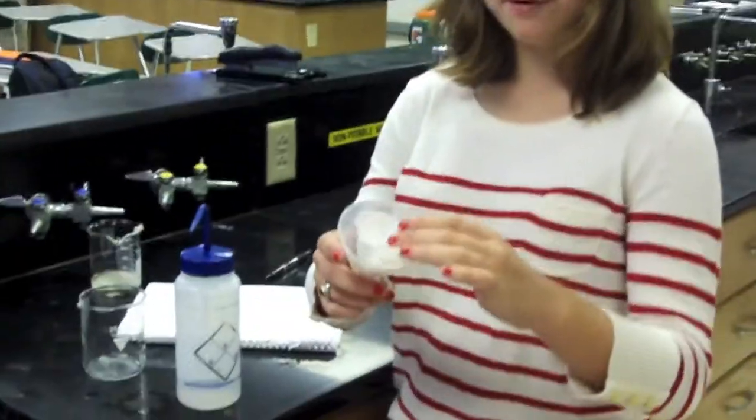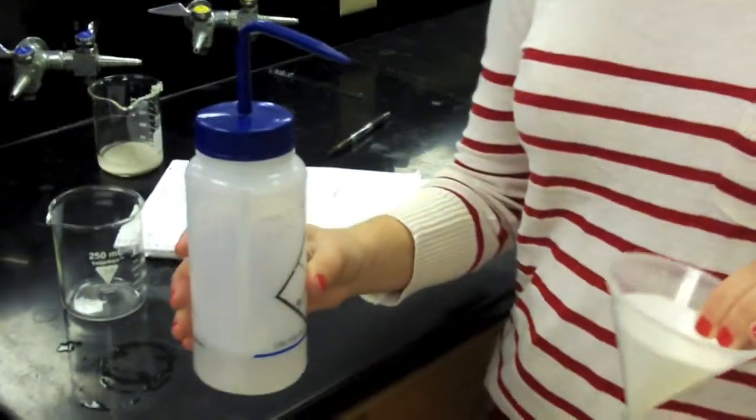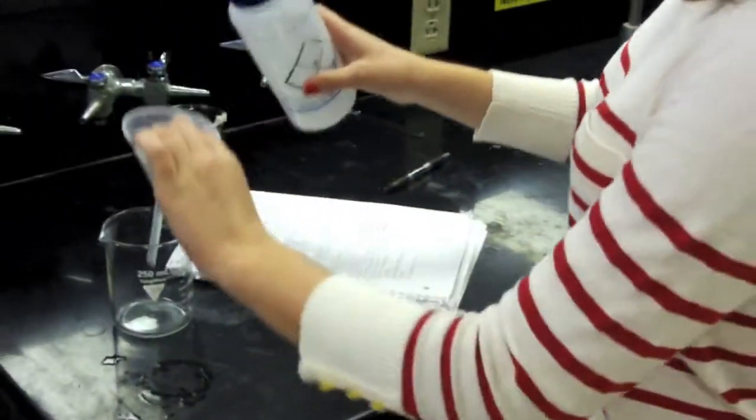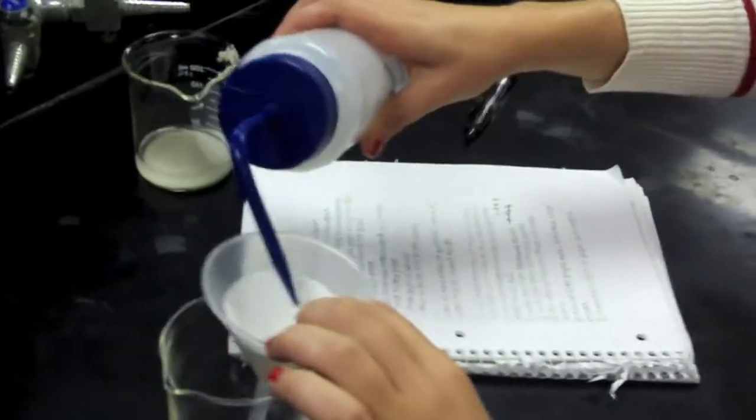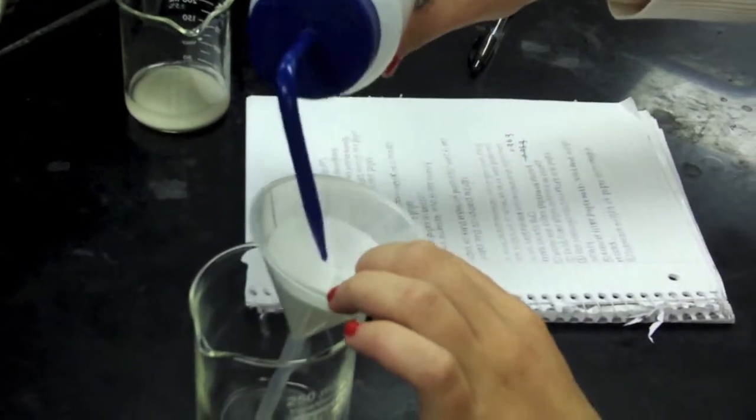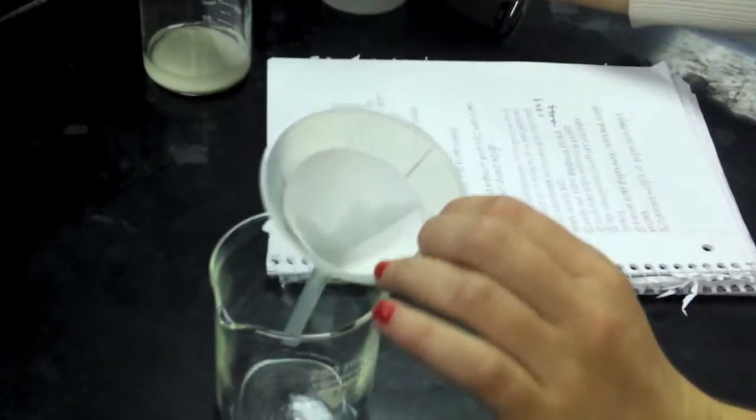If the filter paper doesn't really stay in the funnel well, you can use this DI water to make sure it does stay. Set it inside of the beaker and just get it a little wet so that it stays in place like this.